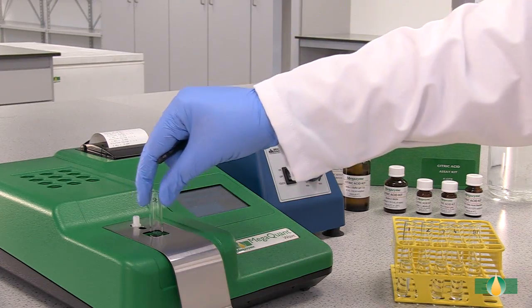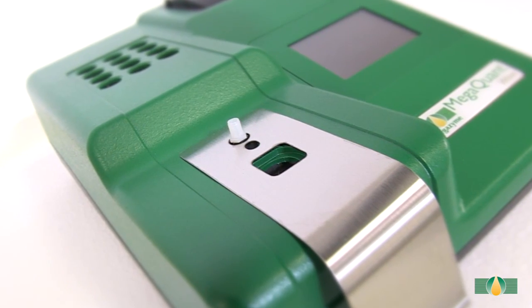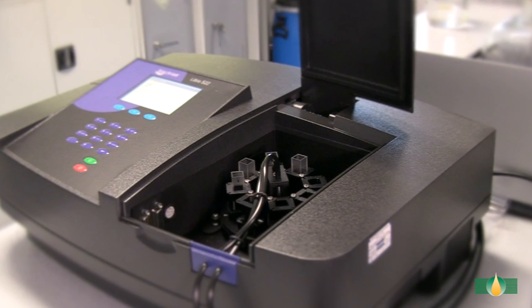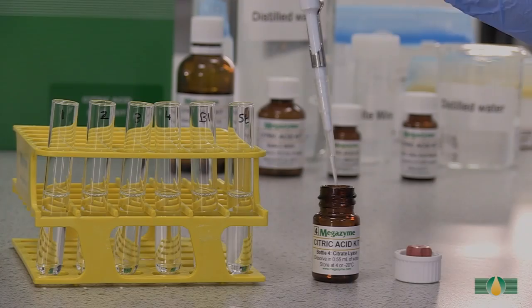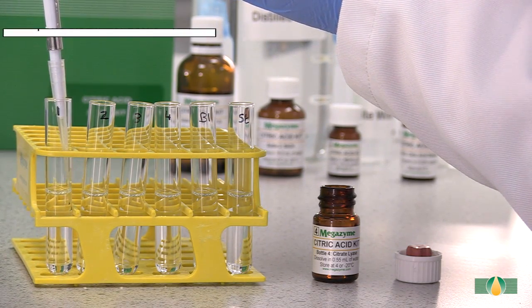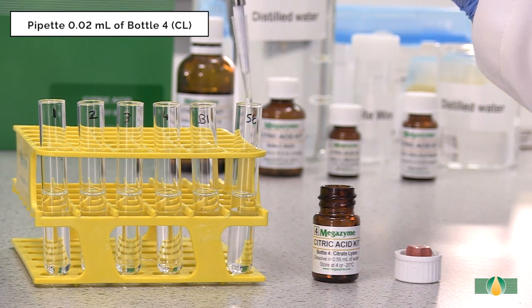In this demonstration, we are using the Megaquant Wave spectrophotometer set to read at 340 nanometers. Alternatively, a recording spectrophotometer with 1 cm path length cuvettes can be used. After recording the A1 absorbance value, pipette 20 microliters of the trigger enzyme citrate lyase into all assay tubes.